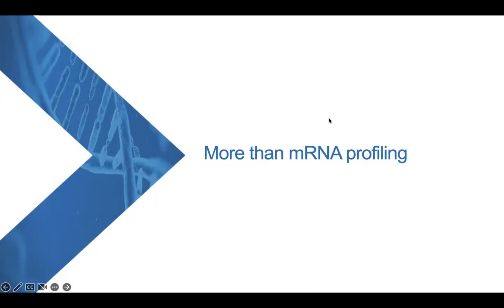How do we make sure that only one bead binds to the primer? Okay, so basically the question is on what is actually on our beads. Every single bead is covered with millions and millions of different oligonucleotides on their surface. So we are trying to capture as much of the mRNA as we possibly can using the poly T tails on the barcoding beads.